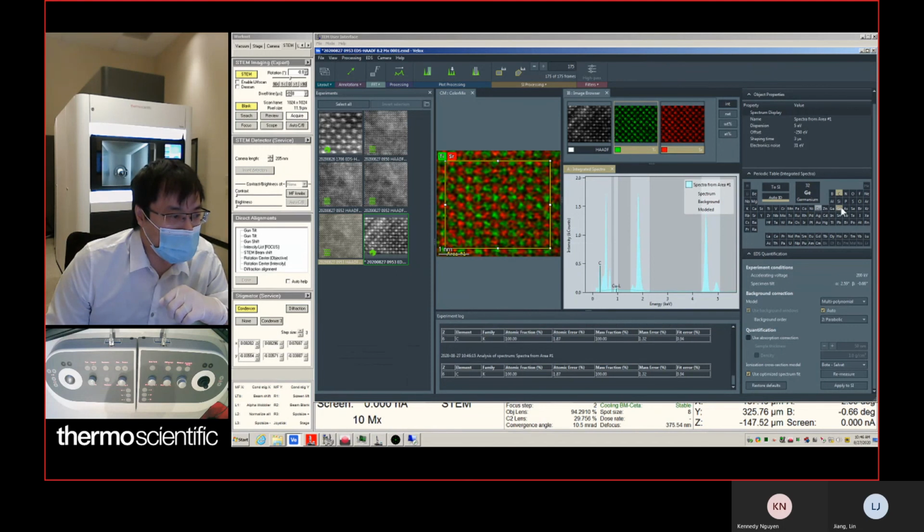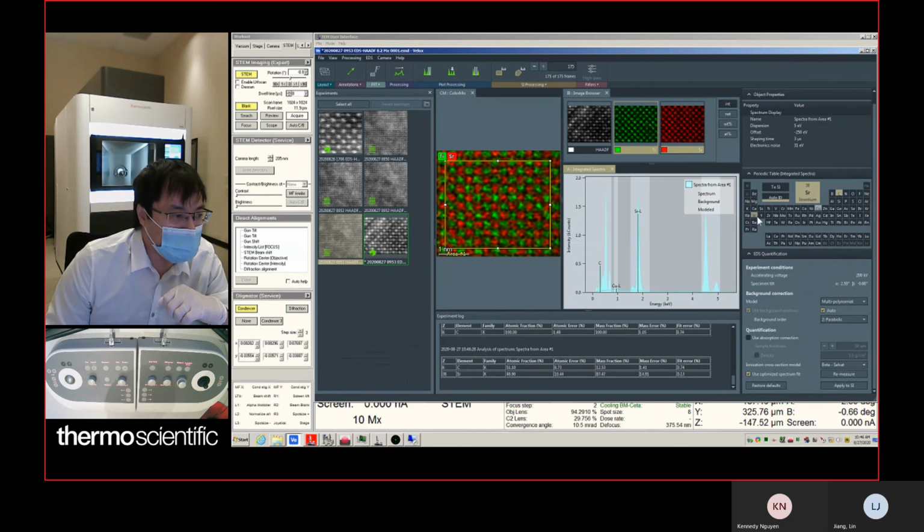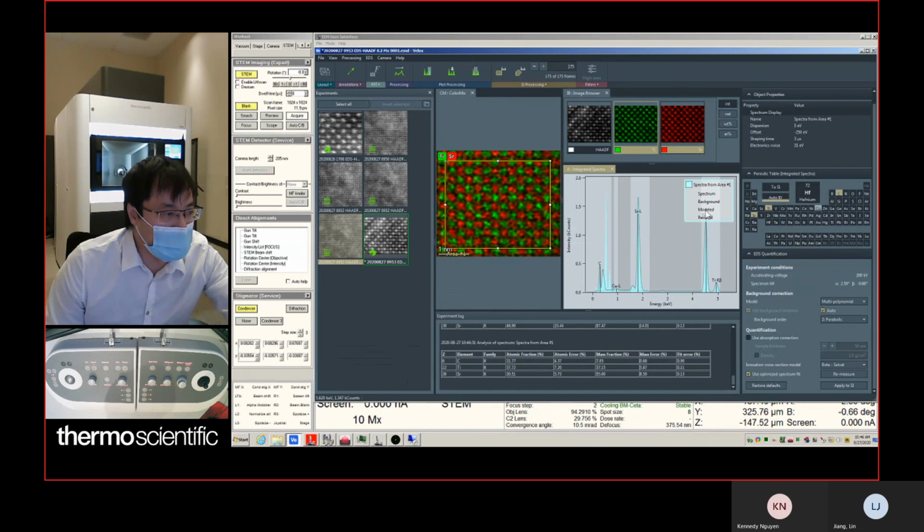That might not have the chemical shift, it's a stable element. So just use rematch, and it's going to calculate the spectrum for you. When you see that, you can see the model titanium peak and the actual spectrum are matched well. So yeah, that's an important step.